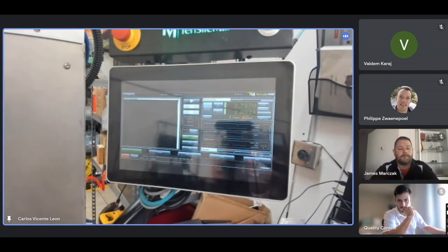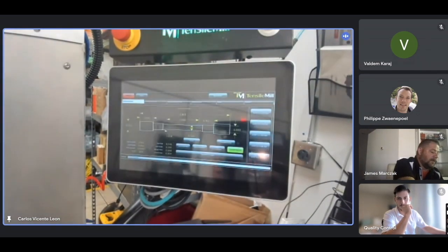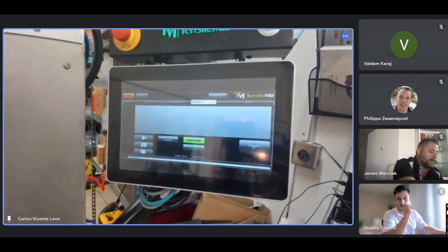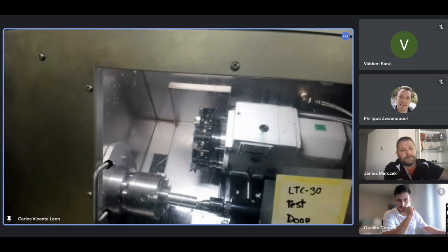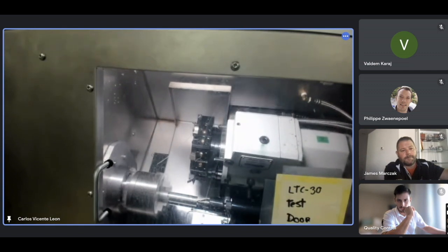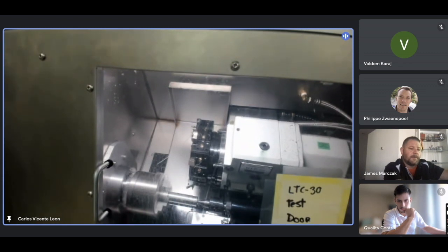Now we can go to Tensile, home, Tensile, generate toolpath. There's the toolpath. And then we can lower the slider and start the program. The torque goes up. I control it with the slider. In this case, now I'm using the mouse to control the slider. Much easier.